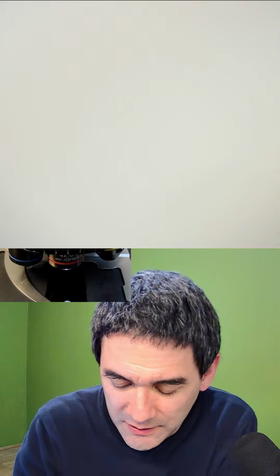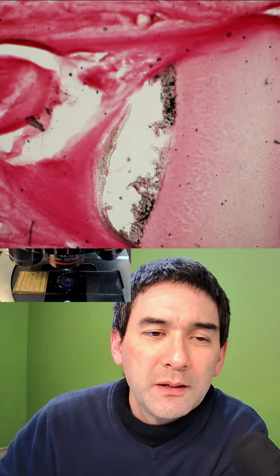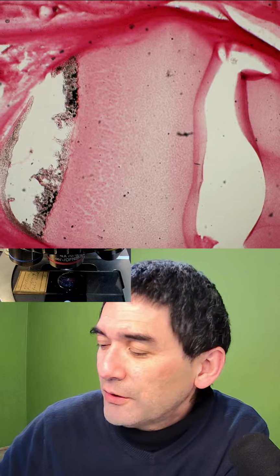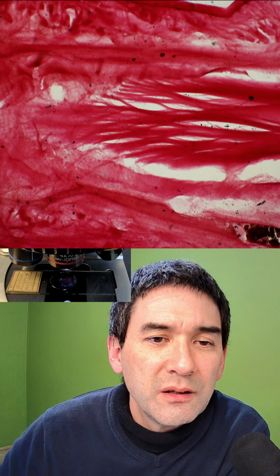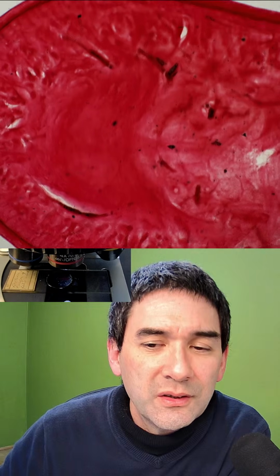And the other one that I have over here, that is the less interesting, I would say. You don't see quite as much, but it's slightly more controversial. It's a human tissue, the finger of a baby, of a fetus. This one over here, that's the fingernail. And here again, if you look at it, you see a whole bunch of muscle fibers and tendons and so on, and the skin on the outside here.